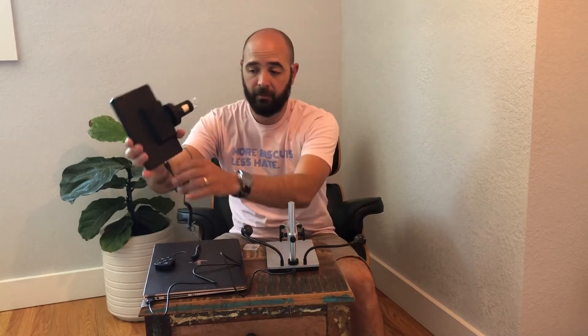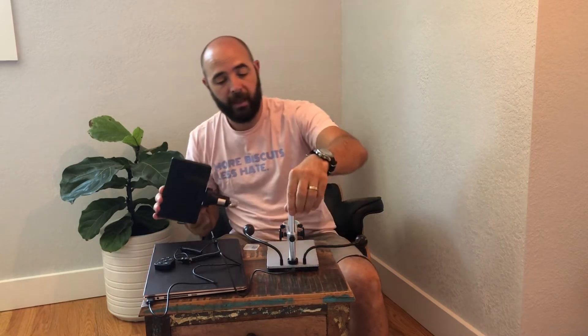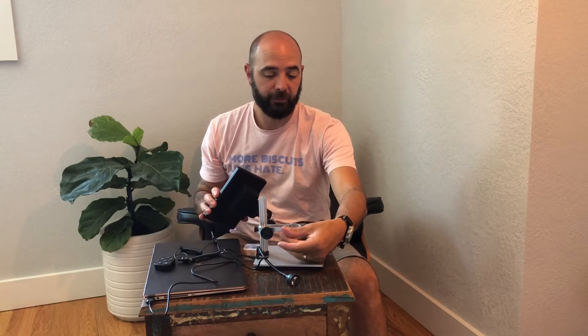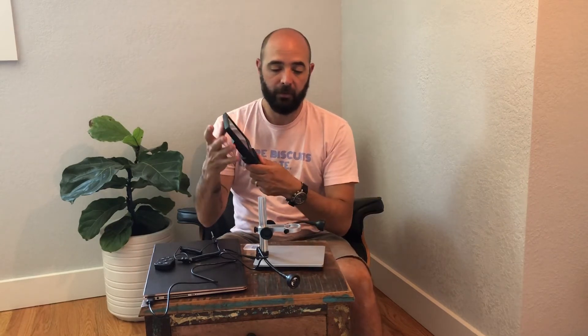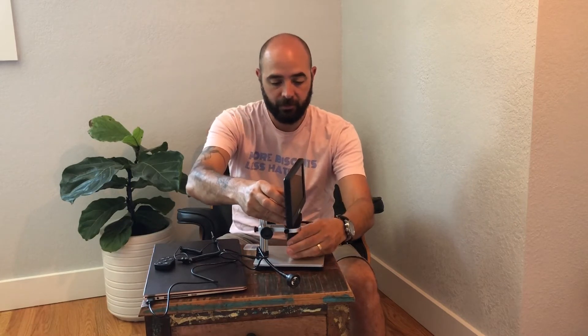It's super easy to use. It comes in a couple of different pieces, but the base comes ready to go. You put the telescoping part onto it, and then you take the display — which is movable as well — and add your base on. There are a couple of mounting screws locked into this, so make sure those are completely unscrewed so that it slides in super smooth, just like that.